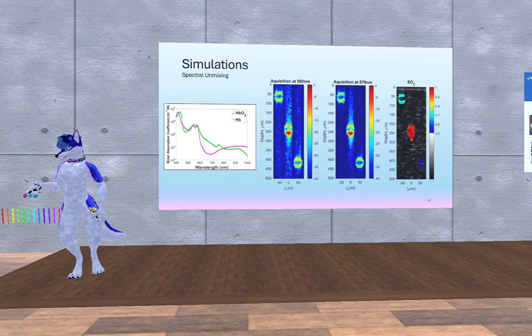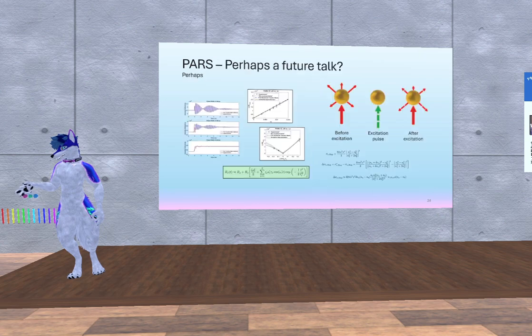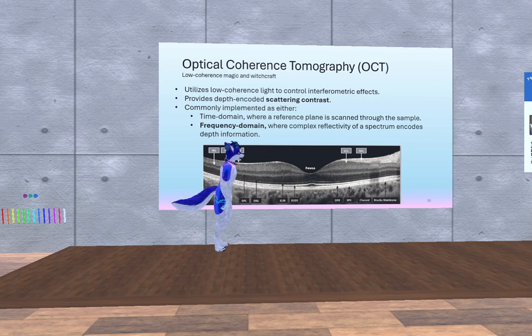Even if I go back a few slides, if you look at some of these actual images, even here, this one's probably been processed to absolute hell, but imagine there's noise in the background here, right? And certainly you could call some of it signal, but what do you call signal? Is this signal? Is that signal? Because your SNR is going to be different if you pick this as your signal, or if you pick this as your signal, and then that's your noise, right? Likewise for your contrast, if you pick a contrast to noise ratio, it might be some difference here versus some difference in here, compared with the noise or something like that. It's a mess.